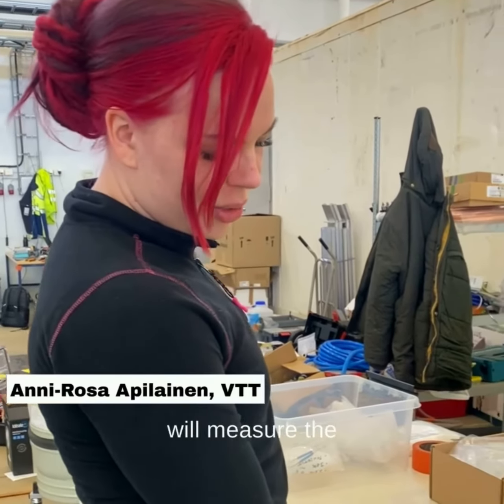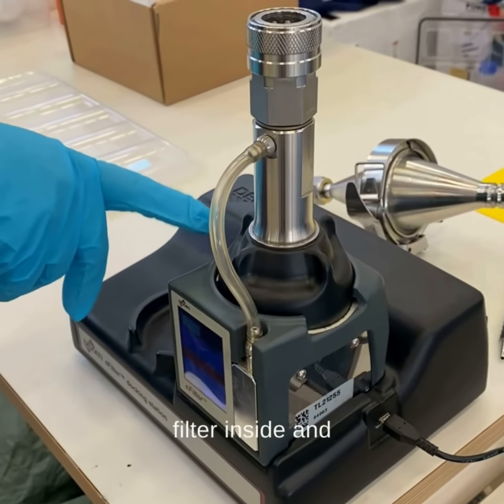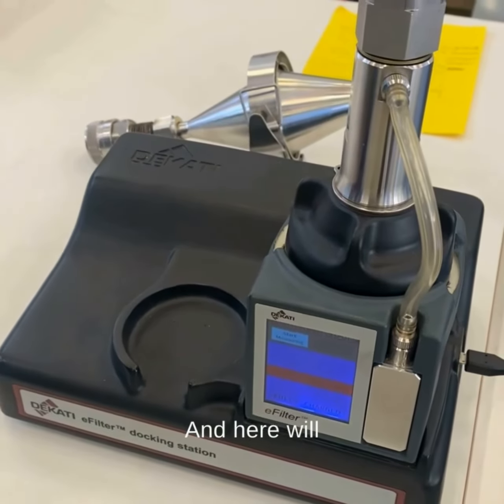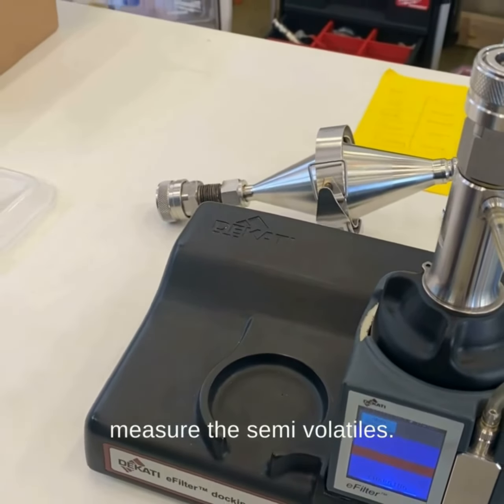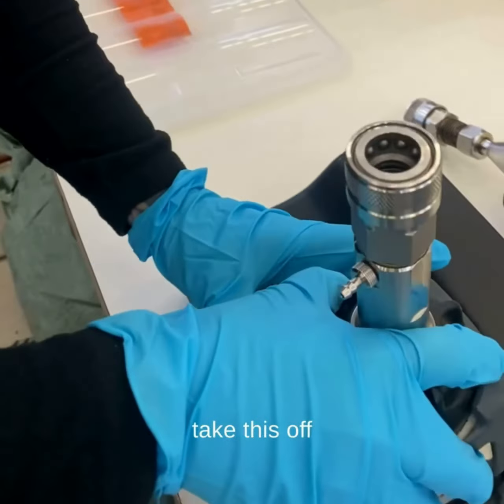This charger will measure the particle number, and there's a filter inside that will measure the mass. Here there will also be another kind of filter, and it will measure the semi-volatiles. First we take this off.